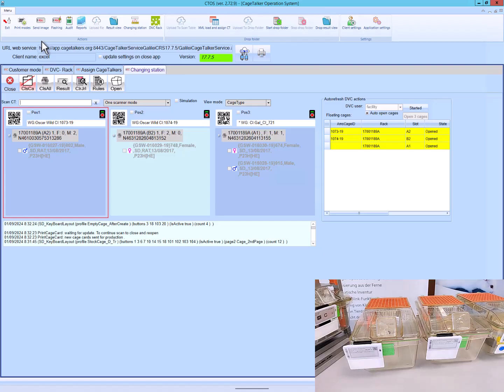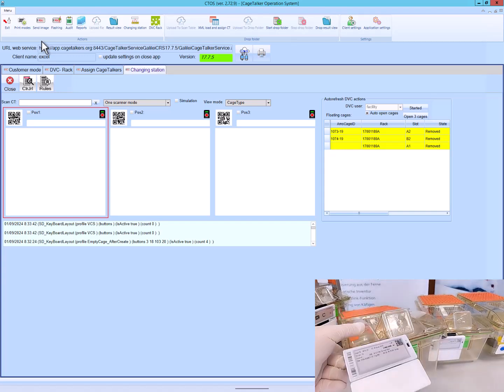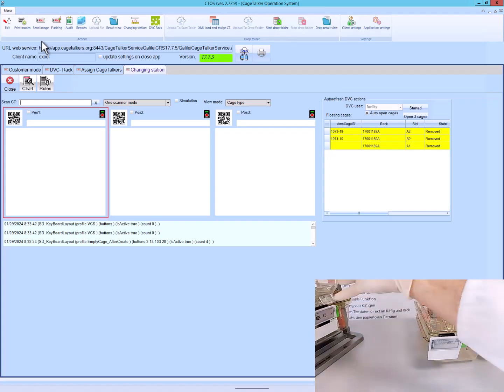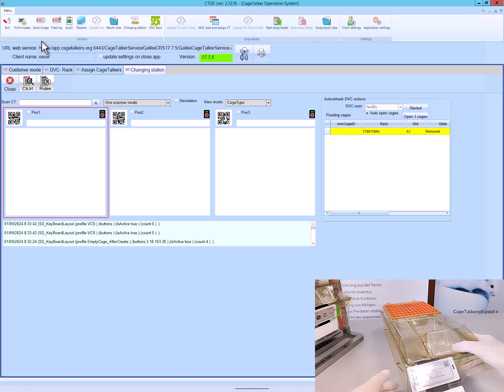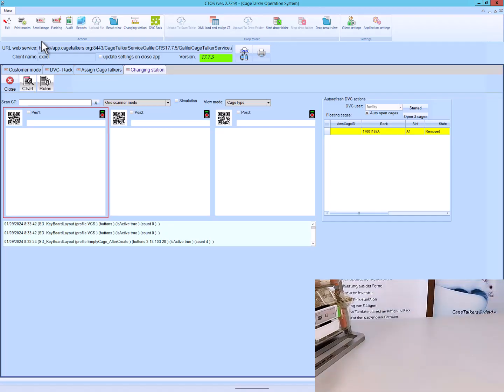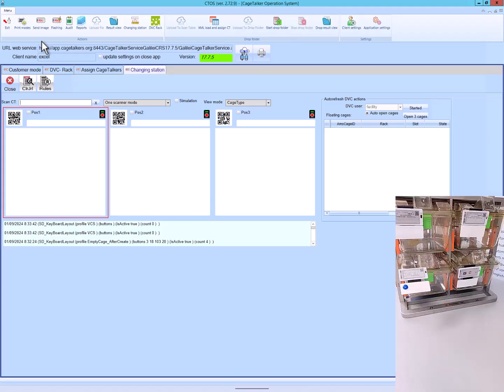Now the cages are also closed on the virtual exchange station with the Stream Deck. They disappear from there, and we return the cages to the rack. We see the position number on returning to the rack. The last cage created can be placed in the rack wherever the user wants. The position will be updated automatically.